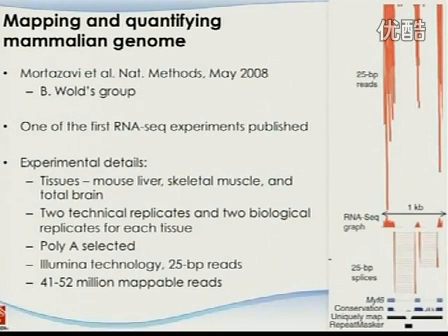So a lot of things that I'm talking about in this paper, you may think are so straightforward, or sometimes even laughable, but that was 3 years ago, and the technology was 25 base pair. Now we know we are pushing 125 base pair for some of the platforms, and for 454, it's even 400 base pair. So technology development really improved a lot.